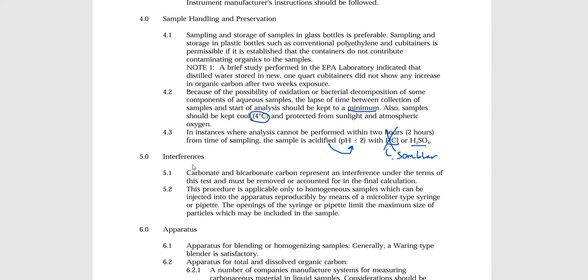What this means is that if I was going out and collecting these samples in the field, I would take my containers and fill each container to the top. By filling it to the top, I'm pushing out all of the air that might get trapped in the bottle as I collect them. In addition, I'm going to probably collect them in some type of bottle that prevents sunlight directly from hitting it. So I probably don't want to be collecting them in clear glass bottles. We've got amber bottles that would work, maybe some opaque bottles that would be okay.